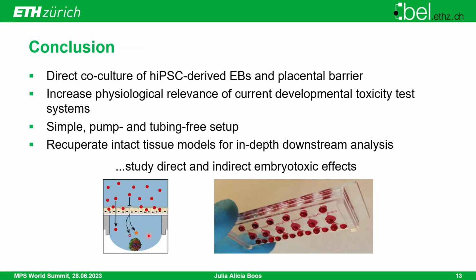So with this, I want to conclude the talk in which I presented the direct co-culture of hiPSC-derived EBs and the placental barrier, with which we aim to increase the physiological relevance of the system and, in general, of developmental toxicity test systems. We tried to have a simple platform that is pump and tubing free, also in the context of this very heterogeneous differentiation of the EBs. And another advantage I want to mention again is that we can recuperate all the tissues after the assay. So basically to do a wide variety of downstream analyses on both of the tissue types.